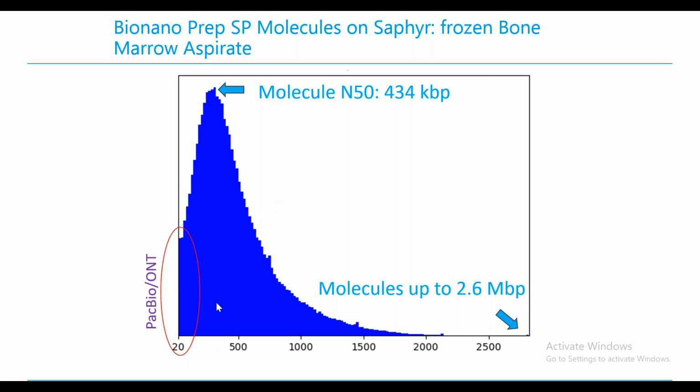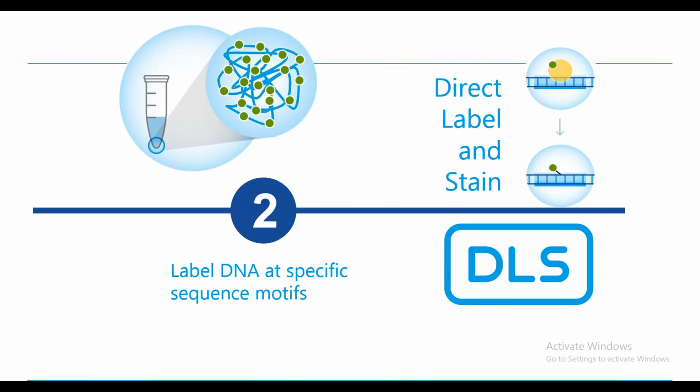And I circled here on the left where the typical read lengths are. You can see longer ones, but the typical read lengths reported in many long-read sequencing studies are just about at our y-axis there. So just orders of magnitude longer than what you can get with long-read sequencing, and because of that, we can visualize structural variants on single molecules.